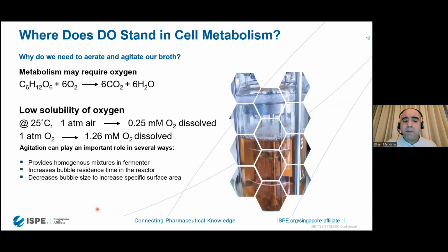Any aerobic fermentation, namely burning glucose as the most readily oxidized and available carbon source, needs quite a bit of dissolved oxygen to complete that oxidation process, or total aerobic respiration, and burn that carbon source all the way to CO2 and water. Each molecule of glucose needs 6 molecules of dissolved oxygen to burn it all the way to 6 CO2. That CO2 that's produced and breathed out comes from the cytoplasm into the broth, right? Combined with such low solubility of oxygen, oxygen immediately becomes the limiting nutrient when we are dealing with aerobic fermentation.